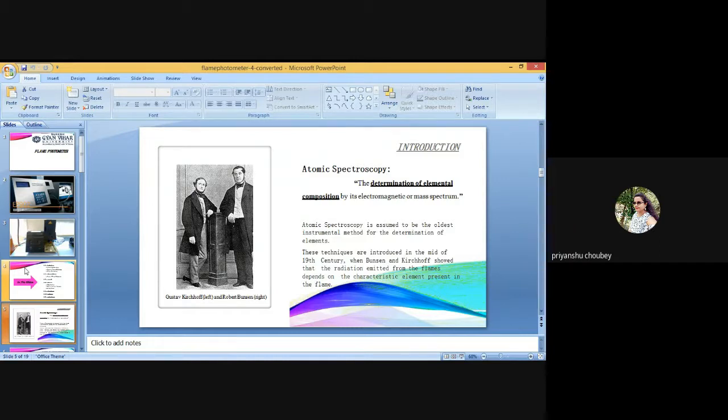However, the common steps required are: first, select the desired optical filters like potassium, sodium, and calcium. Switch on the instrument. Switch on the compressor to get air supply.